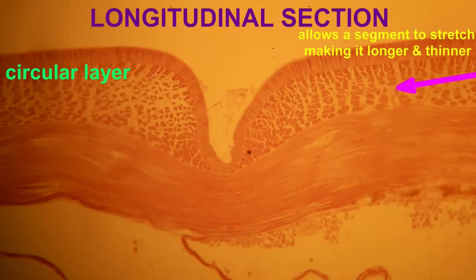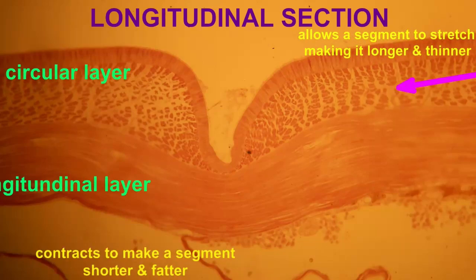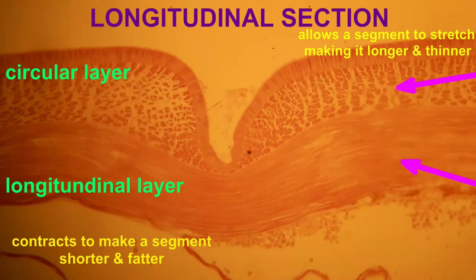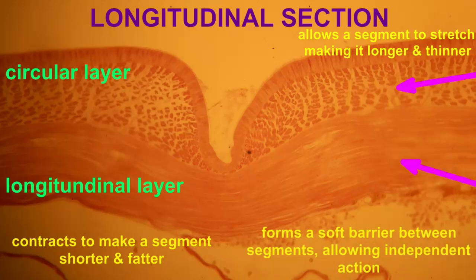Just deep to the epidermis, earthworms possess two layers of muscle: a circular layer and a longitudinal layer.